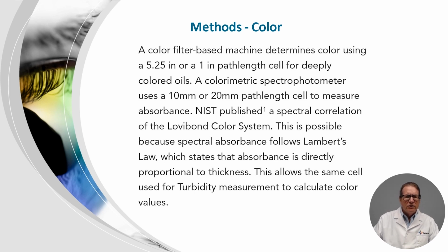We can do this because in 1972, the U.S. National Bureau of Standards, now known as NIST, repeated spectrophotometric measurements of a set of Lovibond color filters. This supersedes earlier measurements that had been done at NIST at the request of the tintometer company.